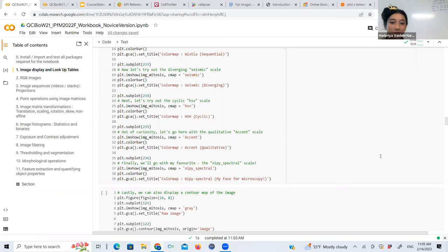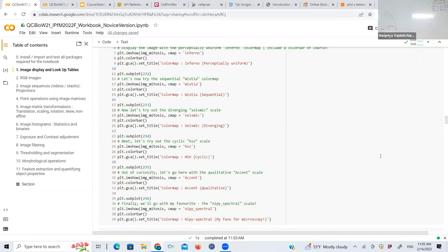They have invert features. Exactly. This is exactly it. Changing the pixel value. Yes, it changes the pixel value. Invert is kind of a nice one because you can always change it back. But something that I always do in a lot of software is I never work on the original image. I make a copy of the image and I work on it. And then if I mess something up, I always have the original to go back to. So you can always use it. It's fine. Just be aware that the pixel values have changed and be intentional about it.